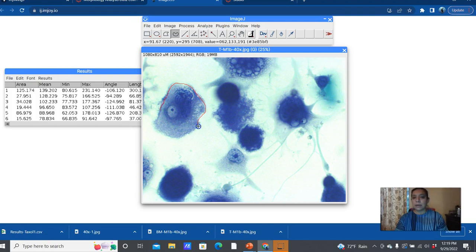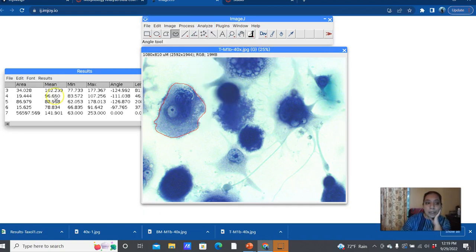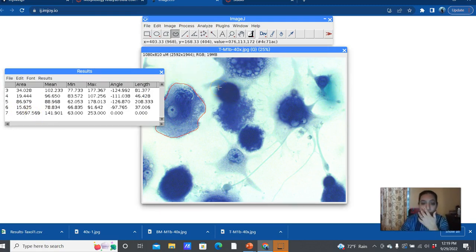And this is something you could do if you have one particular treatment that is really showing a difference. That's something interesting that you can observe, is the number or the volume of cells or the area of cells. And here, when I measure it, you see right here, it's giving me the area of my cell. Okay, and this area is then going to help me. You can compare that between different treatments or different types of cells, different categories of cells. You could do that, right?